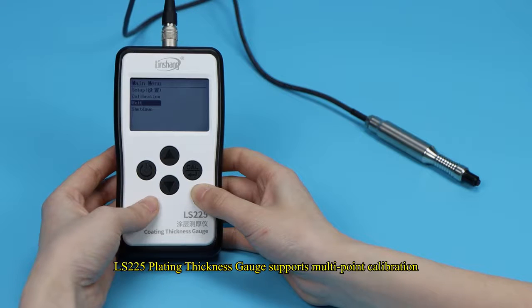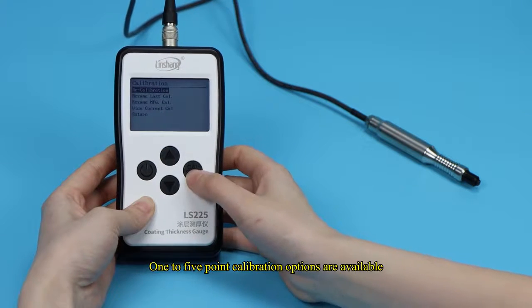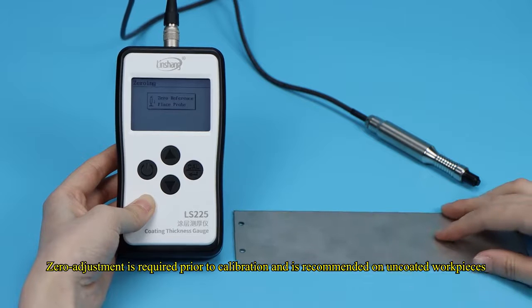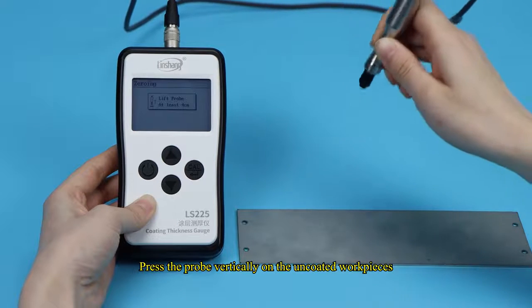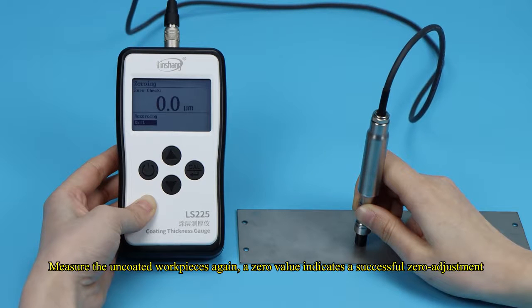The LS-225 plating thickness gauge supports multipoint calibration, with one to five point calibration options available. Zero adjustment is required prior to calibration and is recommended on uncoated workpieces. Press the probe vertically on the uncoated workpiece and follow the instrument prompts. Measure the uncoated workpiece again — a zero value indicates a successful zero adjustment.